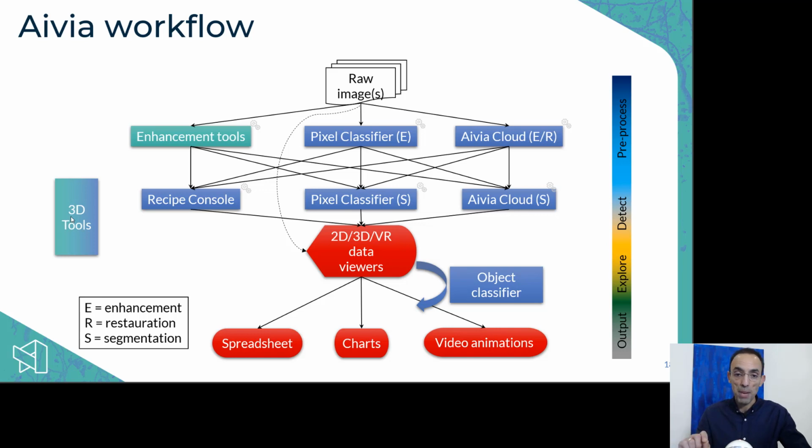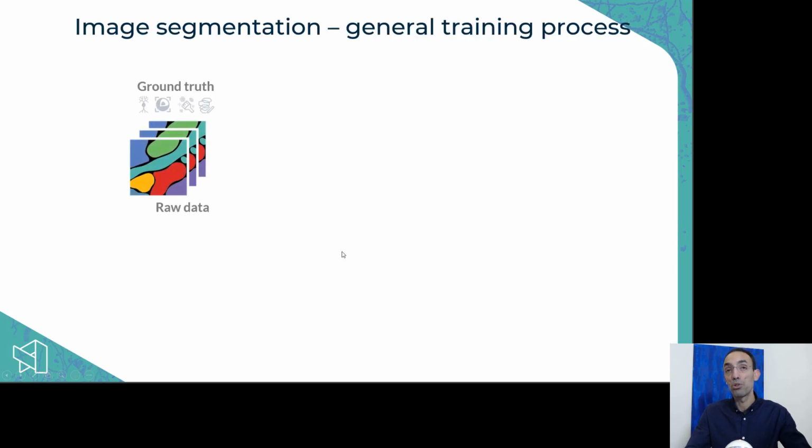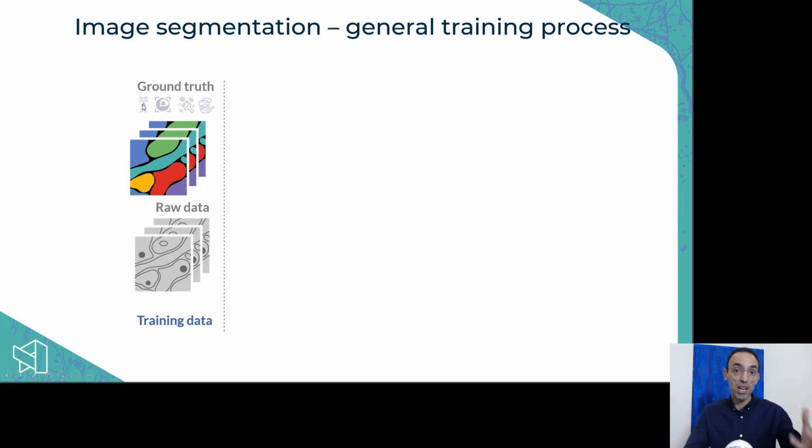Create all the annotations manually, which gives you some results straight away, and you can use those results to then train a deep learning model. That's summarized here as well. So the ground truth can be created in a number of ways. We have a recipe that automatically creates the neuron with a skeleton.